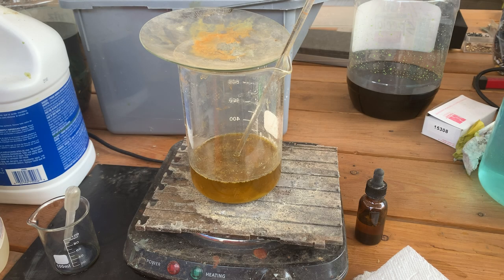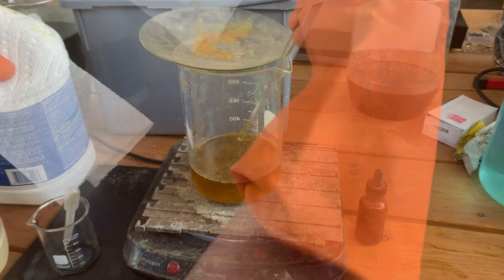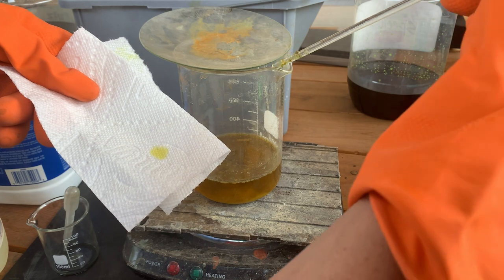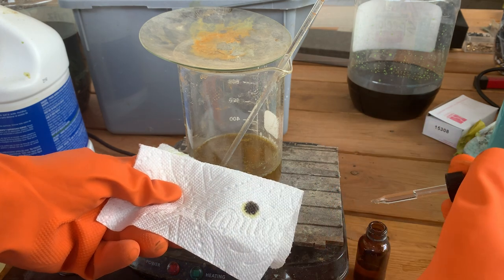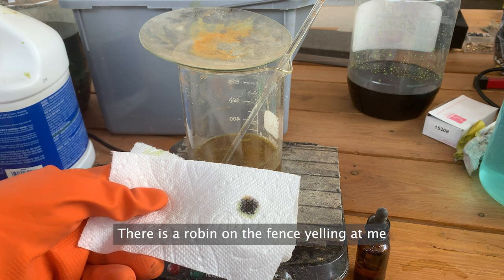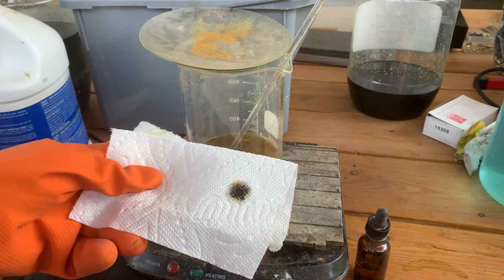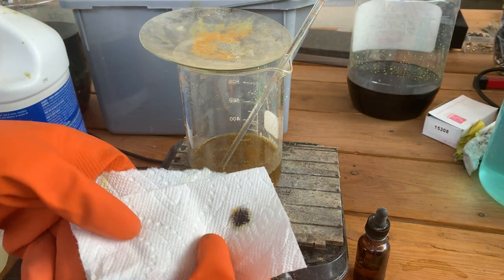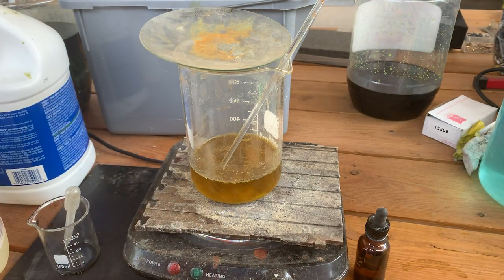Let's go ahead and filter this, but before we filter it, let's do a quick stannous chloride test. I'm going to take a drop out of here — keep in mind that stannous chloride is an acid. Look at that — oh my word. There's a baby bird that fell out of the neighbor's tree and I've got either the mom or the dad yelling at me, but that right there is a very positive test. We got gold like crazy. Let's go ahead and start recovering it.